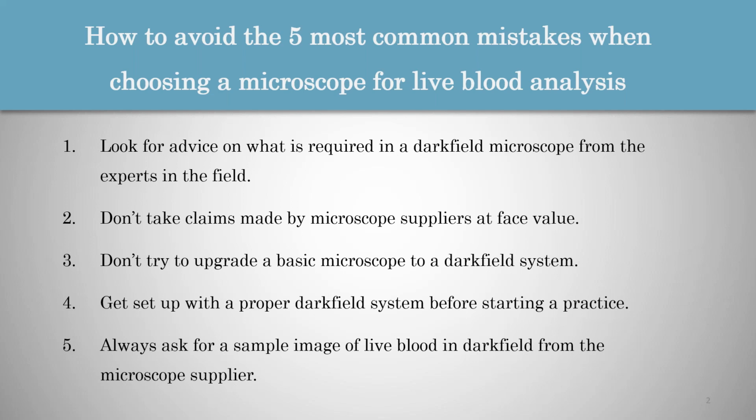And then the last point is just actually a suggestion that we usually, when there's any question about the suitability of a microscope for darkfield, we simply recommend that the supplier should supply an image of live blood in darkfield from the specific microscope. And this can then be compared to the images in our course materials, or attendees can even send those images to us for comparison. And from the image, you'll be able to see very clearly whether the system is actually suitable for live blood microscopy or not.